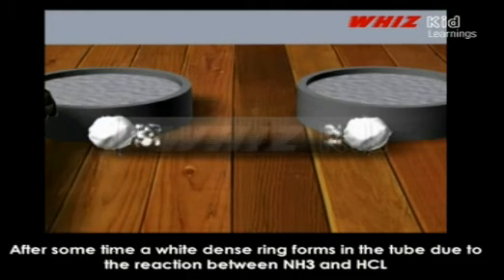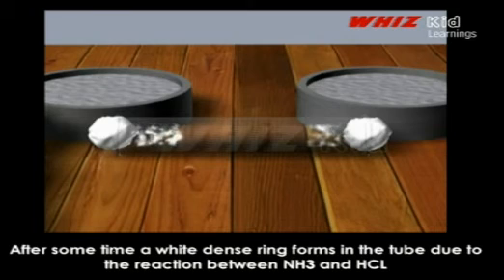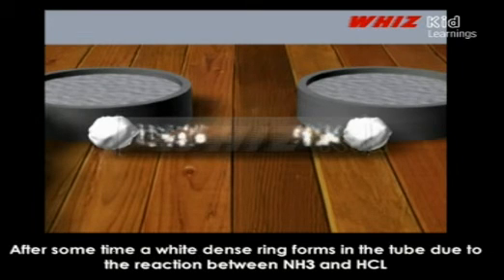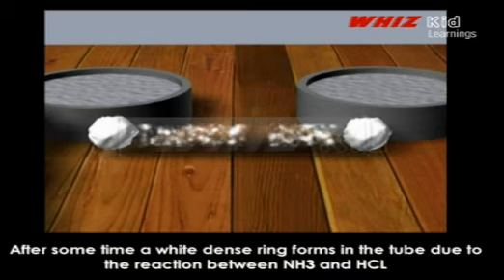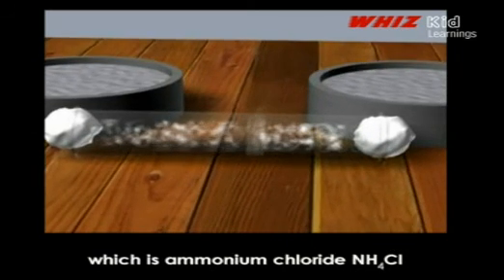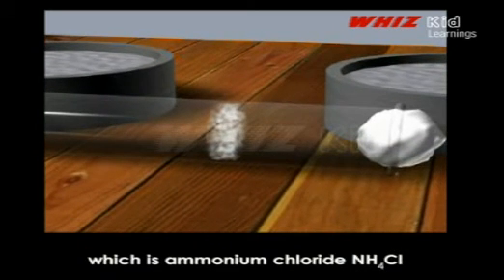After some time, a white dense ring forms in the tube due to the reaction between NH3 and HCl, which is ammonium chloride NH4Cl.